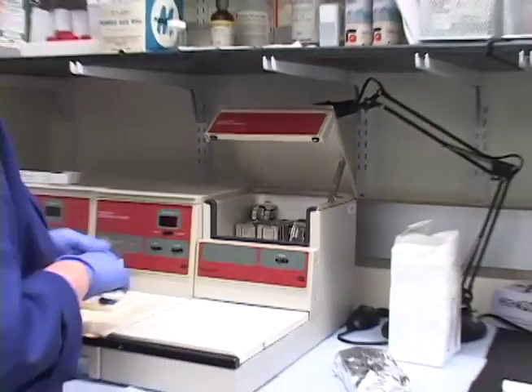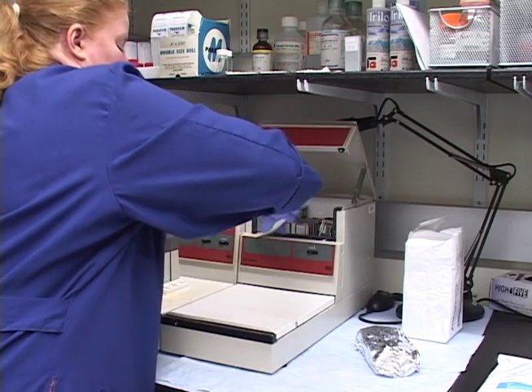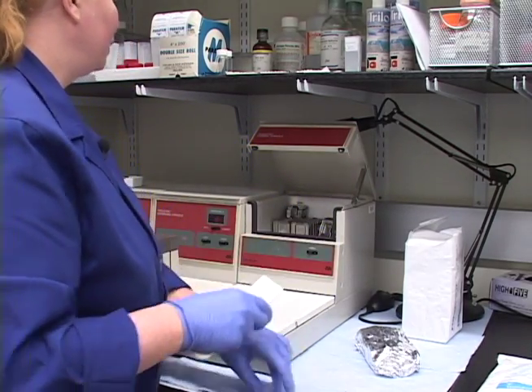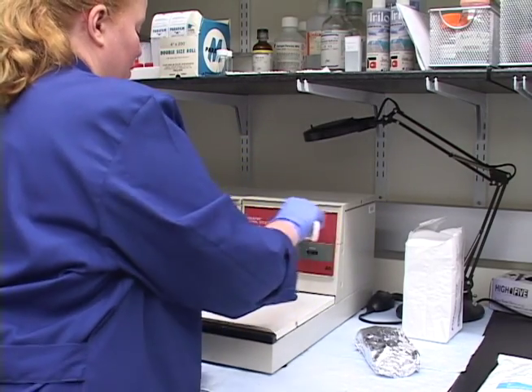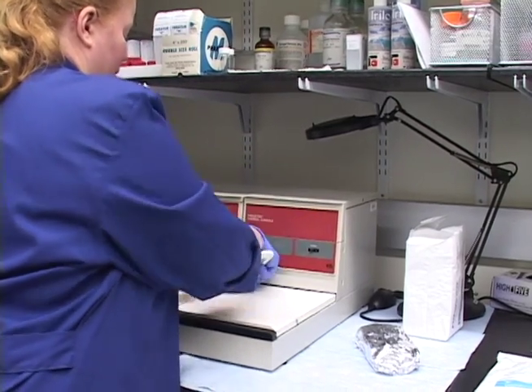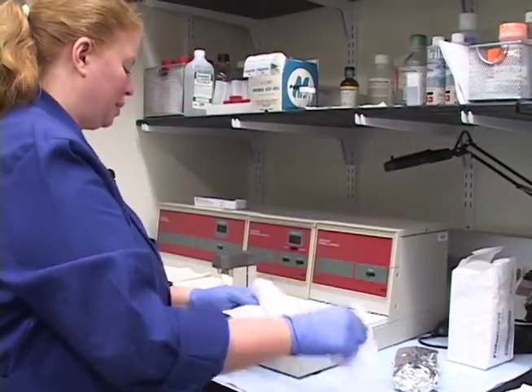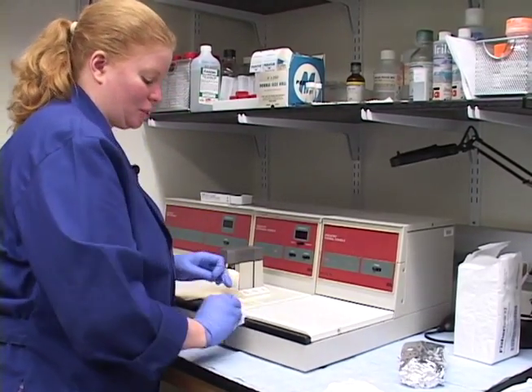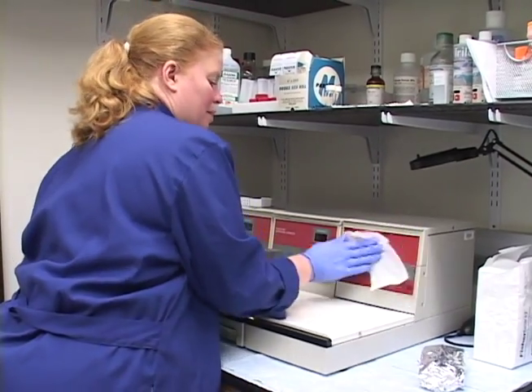It's amazing where this paraffin gets and how quickly. We'll close the thermal console lid and give this a little scrape. I like using the gauze because it has a little abrasiveness to it - it gets all the little extra residue. And that's pretty well done.